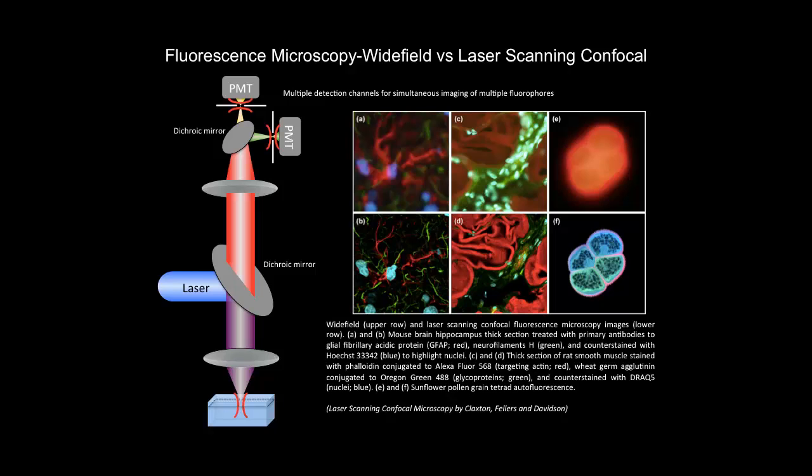So it's really important to know the information about your fluorophores to be able to choose the right optics, the right dichroic mirrors. It's not only dichroic mirrors; these are usually not enough for the efficiency of the signal collection. You also use filters in front of the PMTs. I didn't add them, so I wouldn't complicate the drawing. But if you understand your fluorophores and what you are expecting to image, you'll be able to choose the right optics to detect the right signals.